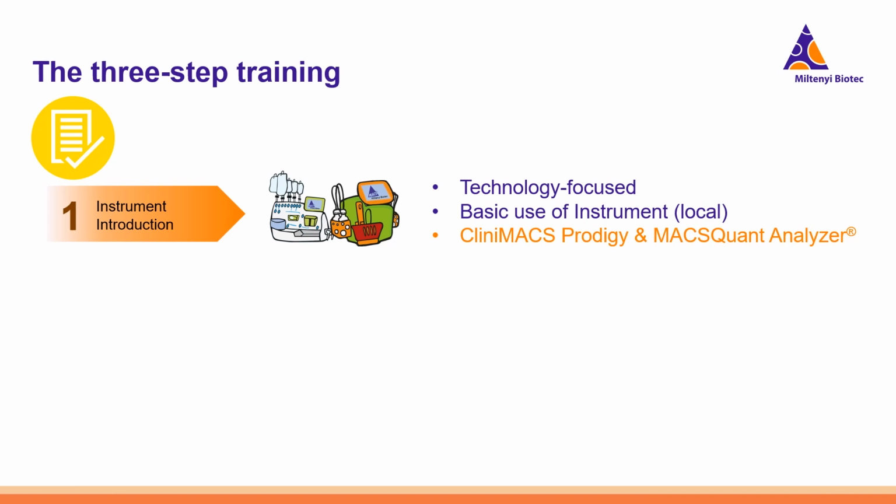These are just introductions into how to operate the CliniMACS Prodigy and the MACSQuant Analyzer instruments, how to switch them on and off, basic maintenance, where different parts go on the instrument, and so on. So there is no deep knowledge, and there's definitely no protocol transfer at this stage. However, this is, of course, very necessary to save time and confusion and prevent errors at later stages.